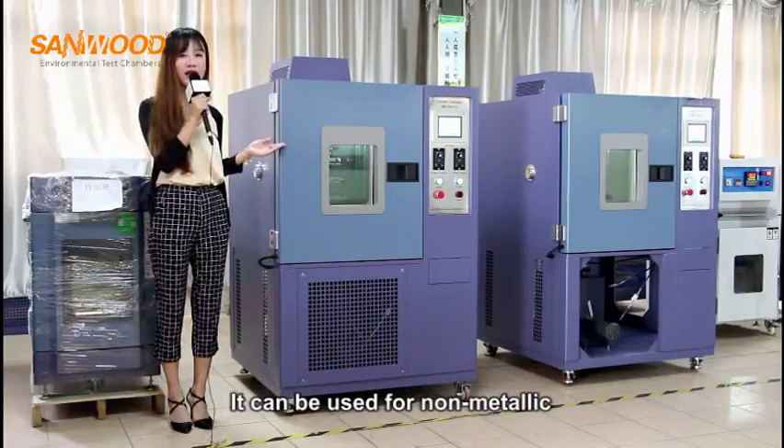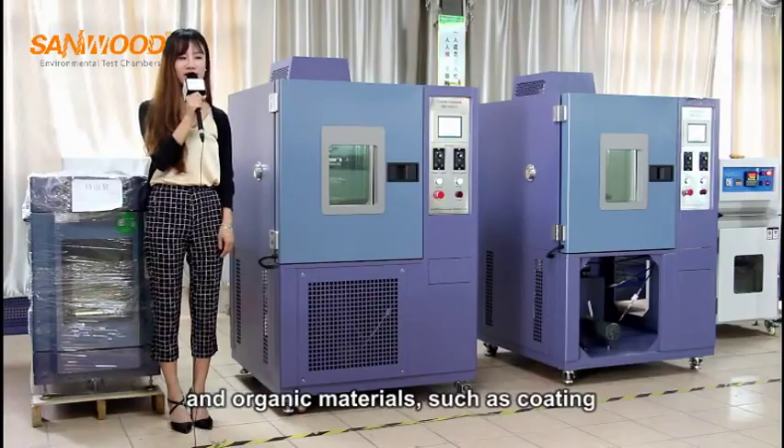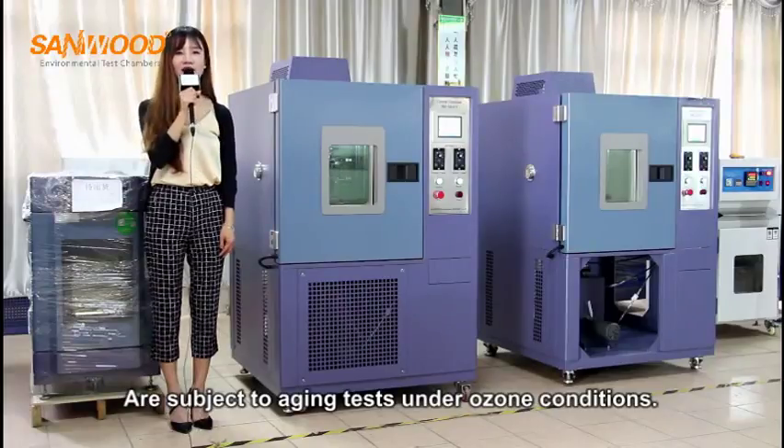It can be used for non-metallic and organic materials such as coating, rubber, plastics, paints, wood, et cetera, which are subject to aging tests under ozone conditions.